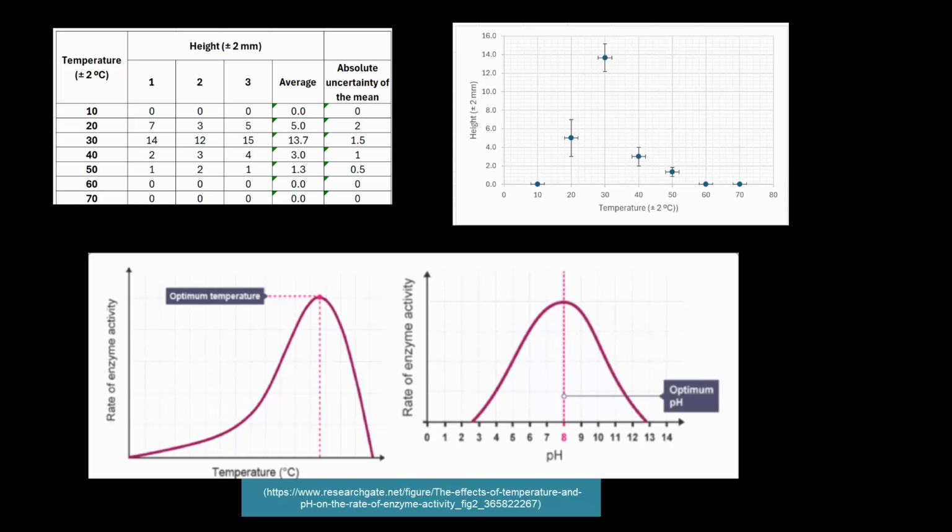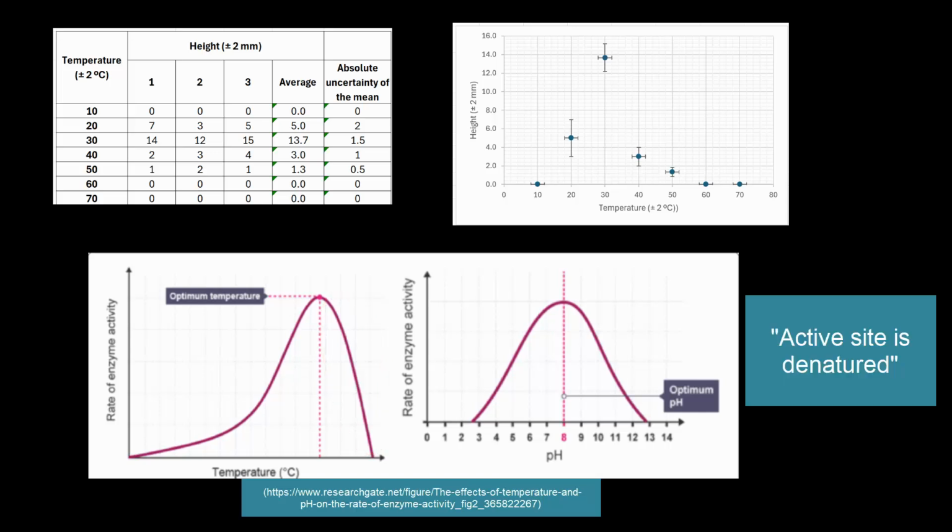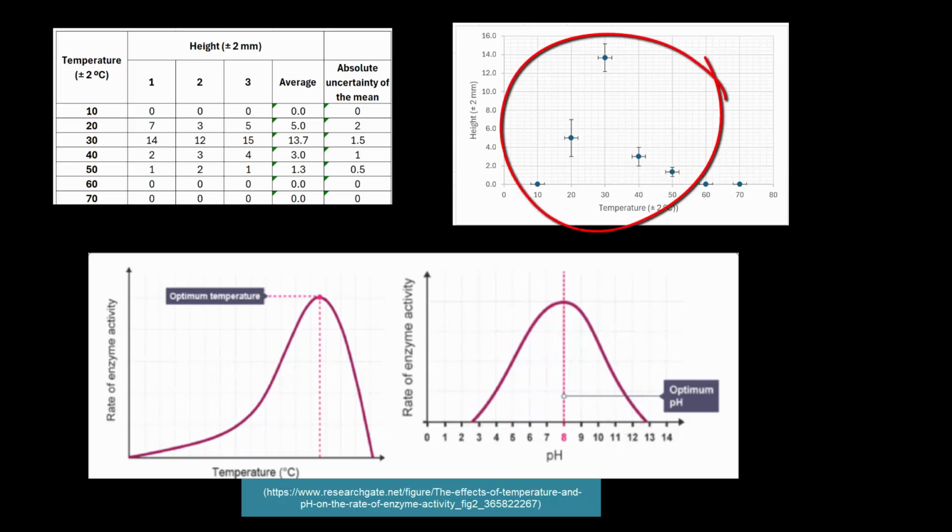It's kind of the reverse of what I was hoping. The temperature graph is on the left here, and it should slowly increase due to rates of reaction and then quickly drop off because the kinetic energy disrupts the bonds and destroys the enzyme. It gets denatured. Similar to the pH graph on the right. So both sides drop off pretty quick because of getting denatured on both sides. And so I got a graph, but not the sort of one I wanted and not good enough.